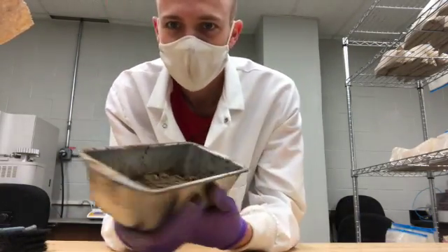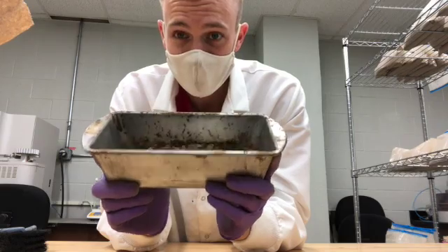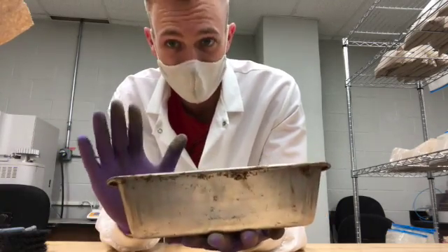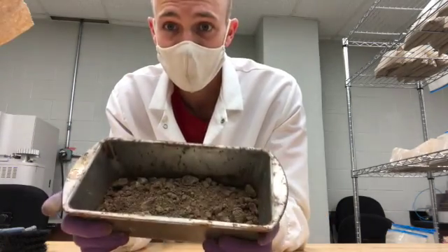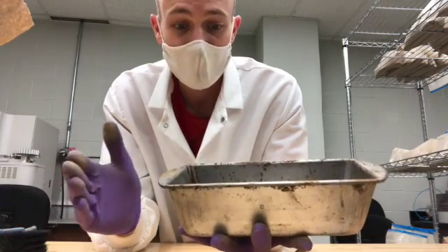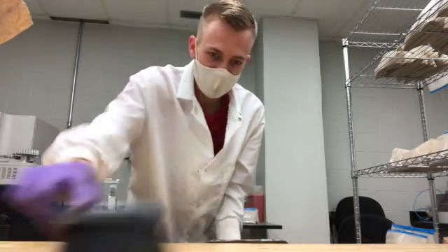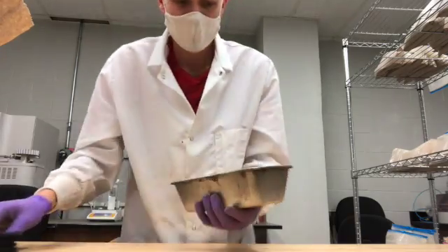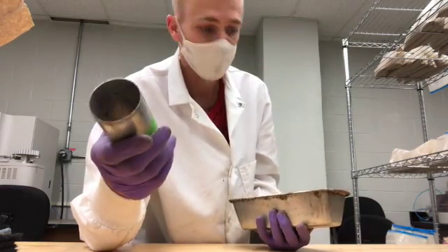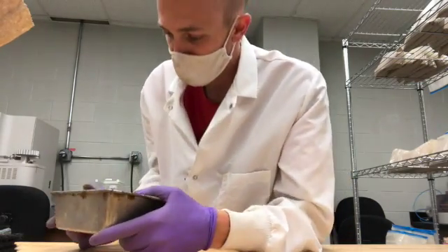And voila — it's ready to go in the oven. After it's been in the oven, I'll take it out, put this pan on the scale, and because I took the initial tare weight of the pan, I can subtract the pan's weight and get the mass of the soil. To get bulk density — grams per centimeter cubed, so mass per volume — you take the grams of the soil divided by the volume of this cylinder.